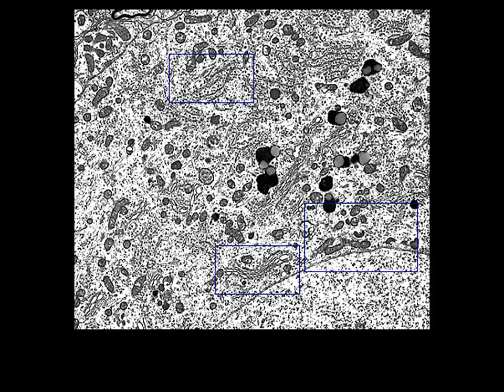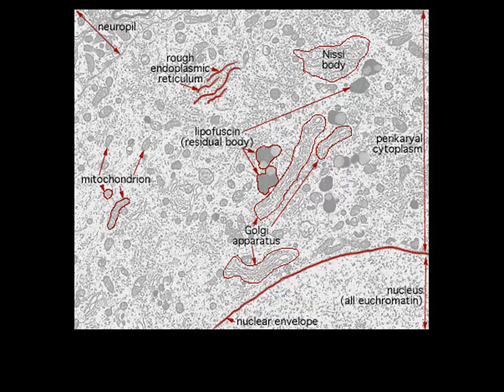This is simply the cytoplasm, the Nissl bodies, and this material that we see inside of a neuron. We can see a Golgi apparatus down here. This dark staining material, these are lipofuscin granules, but most of the rest of what we see is going to be our Nissl bodies.